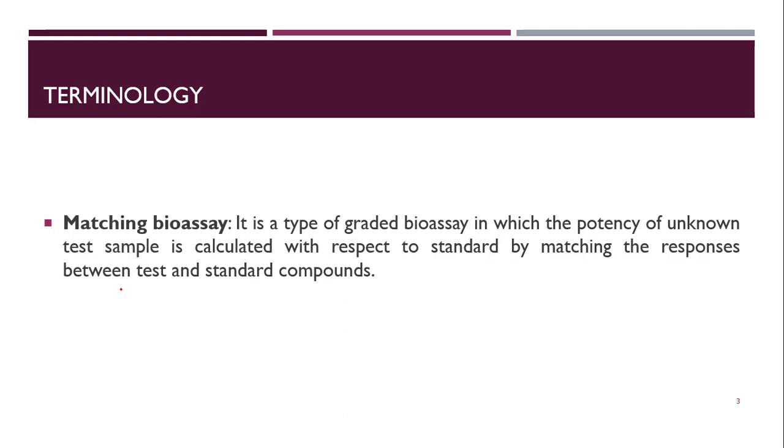We already know the concentration of the standard, and by matching the test dose height with that of the standard, we get to know the concentration of the test sample, and from that we can reverse calculate how much quantity of the drug is there in the test sample.